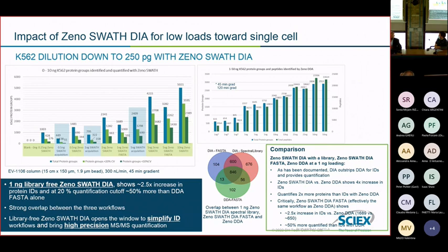The other thing that we do in this case is to try to compare a little bit the different approaches between DIA with library, DIA library-free, and then using DDA. I would say the poster has more updated data, but we see a nice overlap. Of course, DDA suffers the necessity of having longer gradients, but the benefit of the multiplexing is, of course, there. So it's your approach.